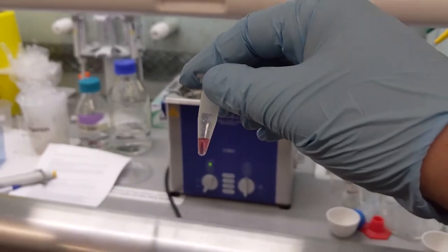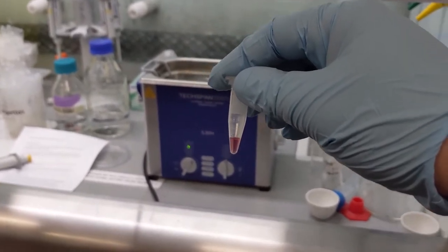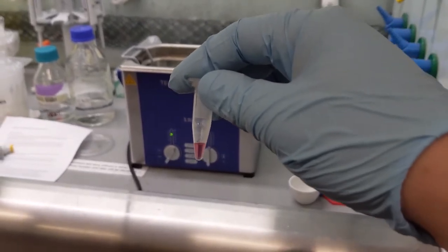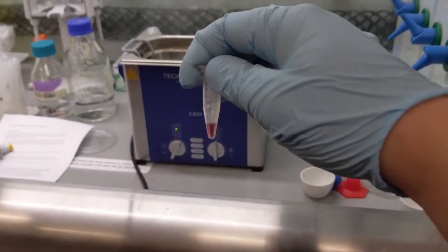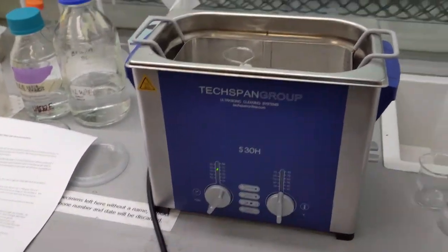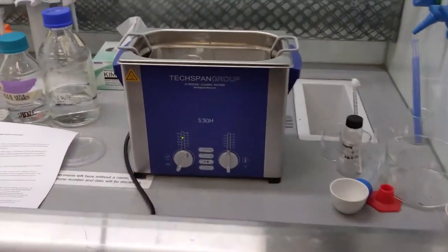Here we have our sample that has been diluted. And to create a monodisperse solution, we are going to put it in the sonicator for 15 minutes. At the end of this, we should have broken up any clumps of nanoparticles that may have formed, and we will end up with a solution we can drop cast onto the TEM grid. So we'll put that in, press play, and we can see that. This will take 15 minutes, so we'll come back later.